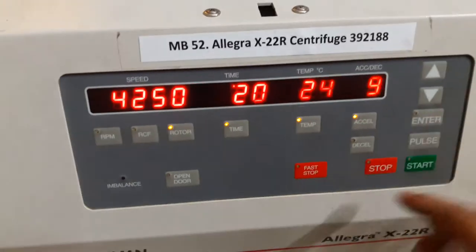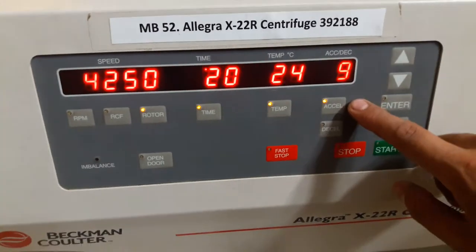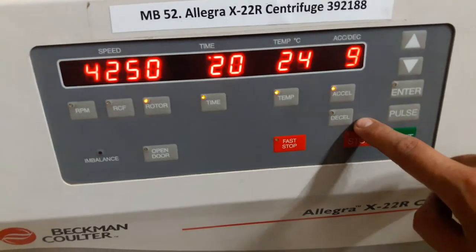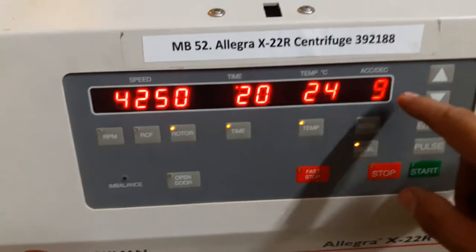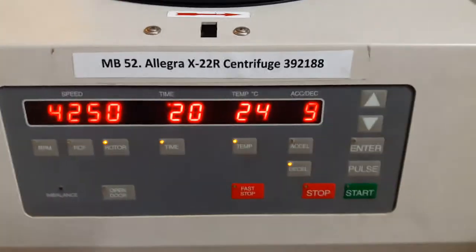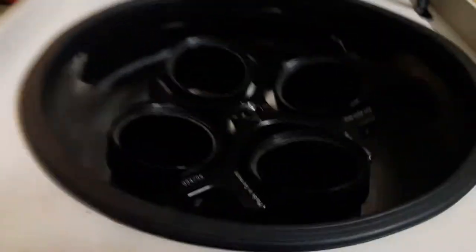I want 20 degrees. These two buttons are for acceleration and deceleration — both of them are set to 9, which is the maximum.